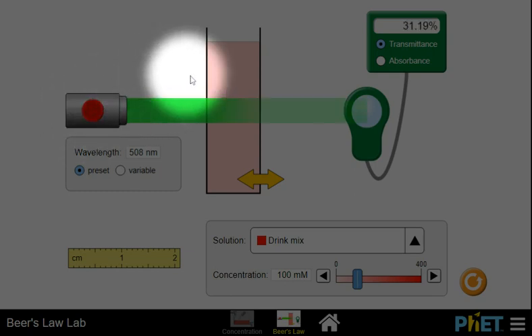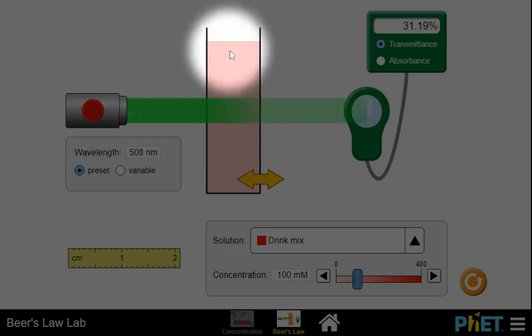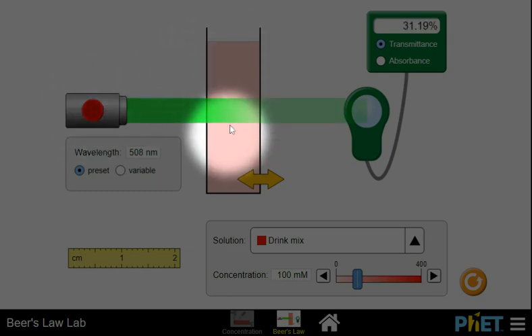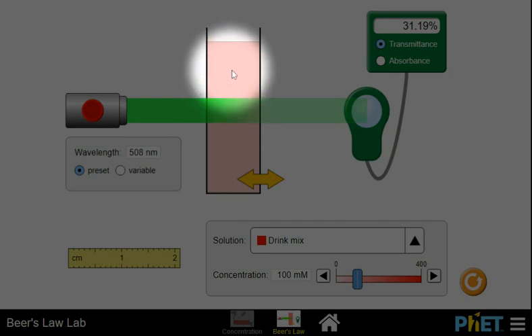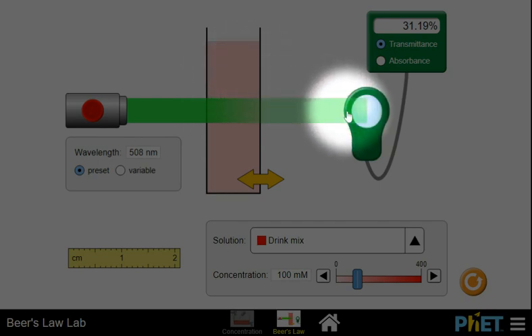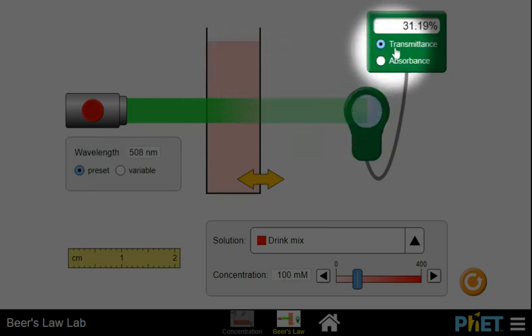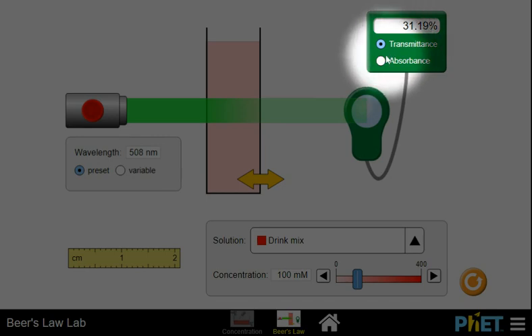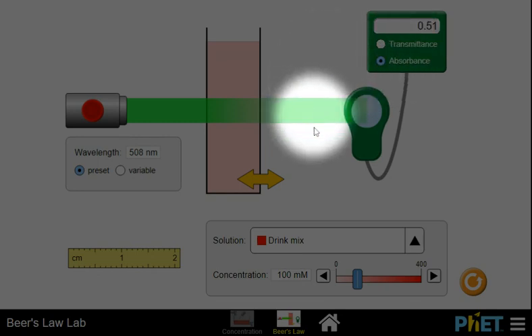You have a sample holder, you have a detector, a readout, and we like to have the readout on absorbance, not on transmittance.